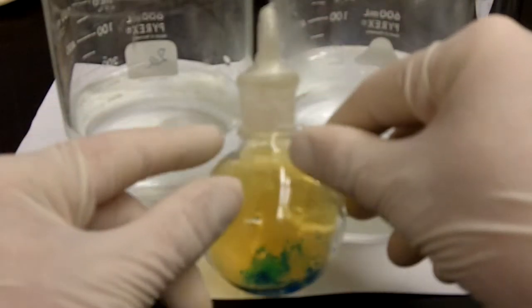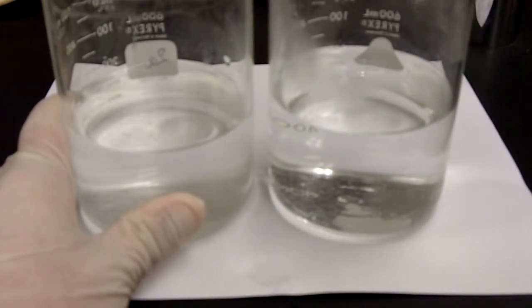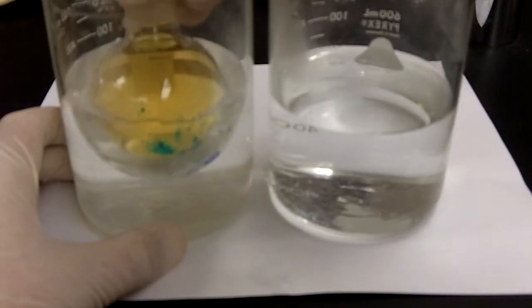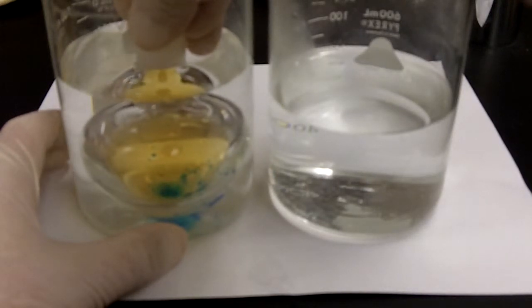We're going to subject this round bottom flask containing this NO2 N2O4 mixture to two separate temperature extremes. I have here a beaker of very cold water and over here a beaker of very hot water. First, immersing it into the cold water, room temperature closer to the temperature of the water in this beaker.